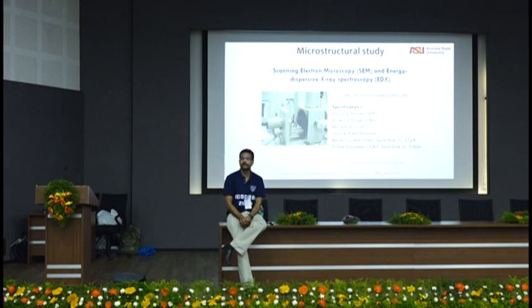I did not know anything about NMR until about 5 years ago. So I went to a professor of physics who was about to retire at Arizona State, a very old man, 75 years old, who built his own NMR 25 years ago. The sophisticated thing that this company has built, he built his own. So I went and told him that I want to learn NMR. He said, yeah, perfect, I'll teach you. And he asked me first question, do you know quantum mechanics? I said, no clue. I have seen Schrodinger's equation. That's pretty much what I know about quantum mechanics.